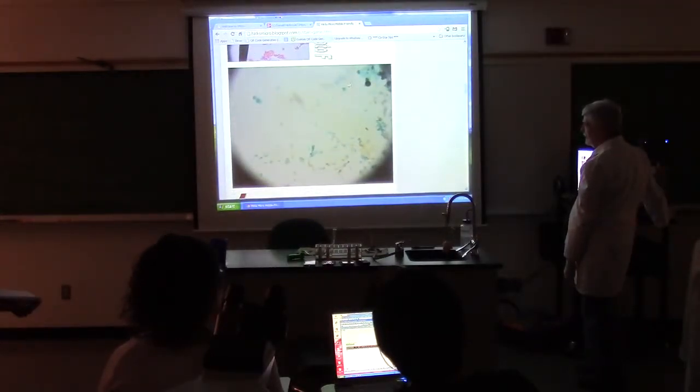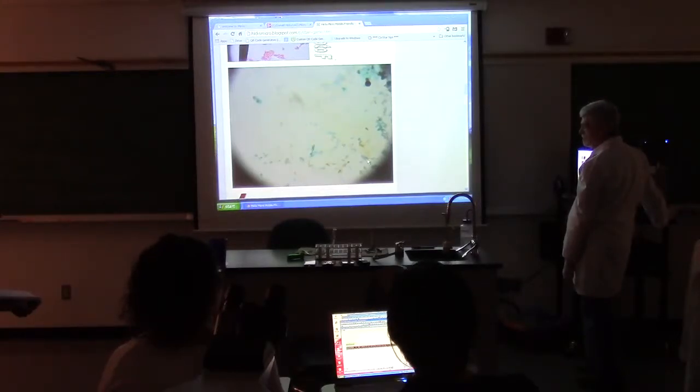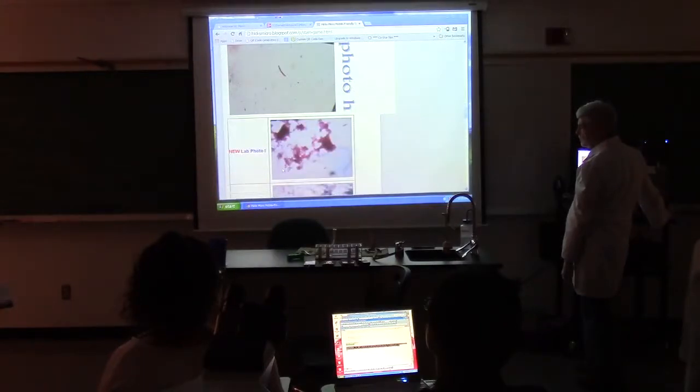All those little eggs. There's only one rod, 2 rods, 3, 4, 5, 6 rods in the whole picture. One of them has a hole, but it's all repeating egg shapes. So that's one that's gone all to endospores. This is also one that's gone all to endospores. Red rod, gone all to endospores. This is an acid-fast positive. There's a few blue ones.